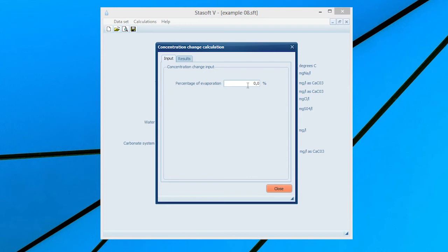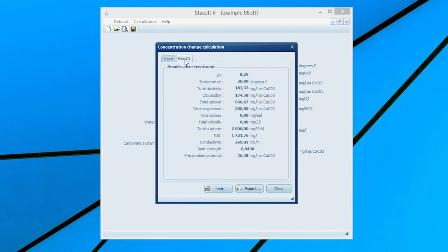Enter the percentage of the water that is evaporated by typing 40 into the percentage of Evaporation input box. Selection of the Results menu option will bring the Results After Treatment window onto the screen with values for the new state of the water.